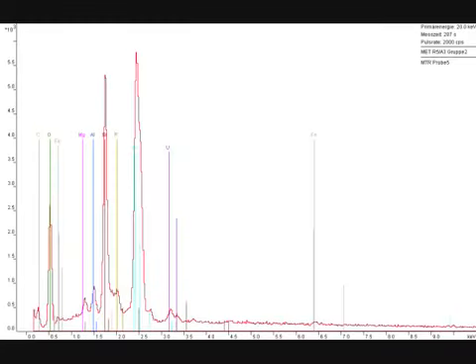Let's just have a look at that. So let's take a look at this. What you can see here is a graph that was done by a professional. The graph itself was done by the electron microscope, of course, but the labeling was done by a professional. There are tables for the specific peaks of the different elements, but I think it would have taken me 20 hours just to analyze one single probe. So anyway, what you can see here is this major peak on the left side, sort of to the middle. That is from bismuth, as you can see.